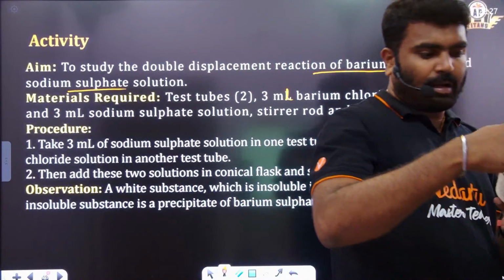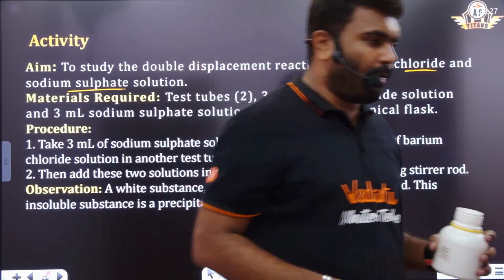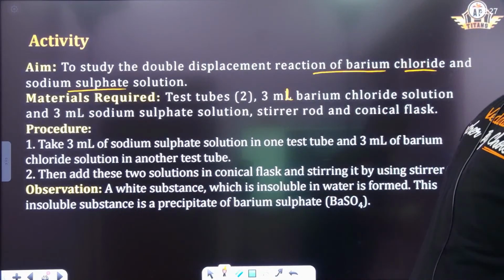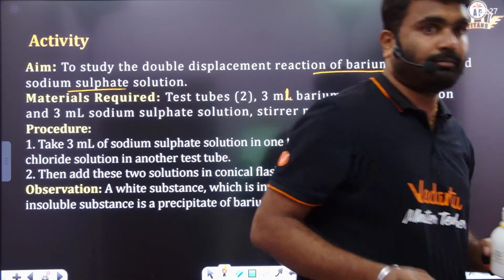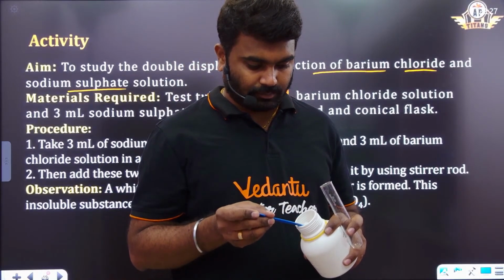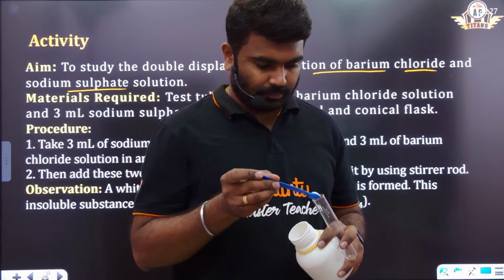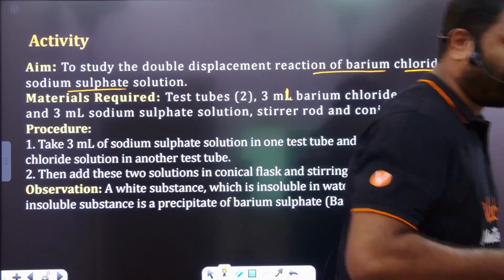I am taking sodium sulfate in one test tube. Okay, I have taken sodium sulfate in one test tube.